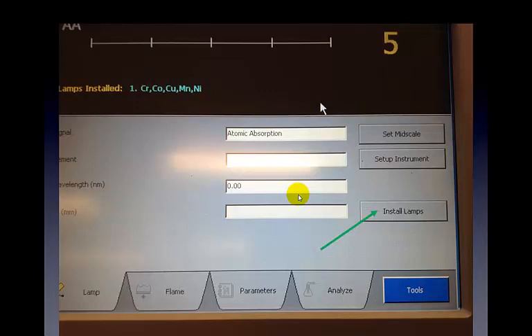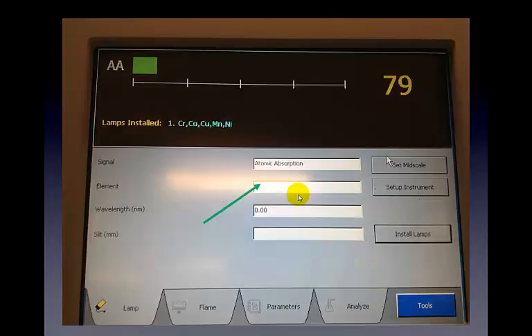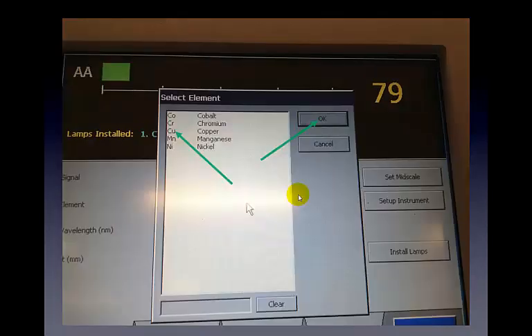Next, press the install lamps button. The dialog box shows the instrument recognizes the lamp type — select on by ensuring there is a check in the on-off box, then press OK. Because this is a multi-element lamp, we need to select the element for our analysis by clicking the text box next to the word element. A dialog box pops up with a list of all elements the lamp can analyze. For this experiment, we will be selecting copper, then pressing OK.